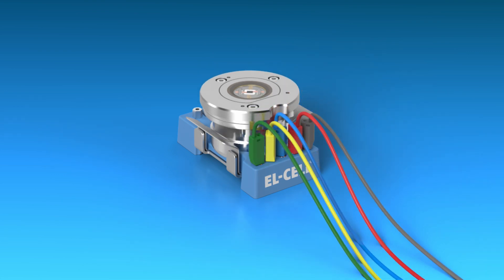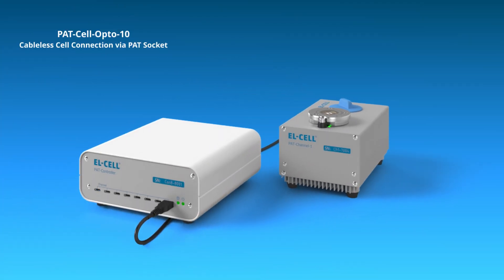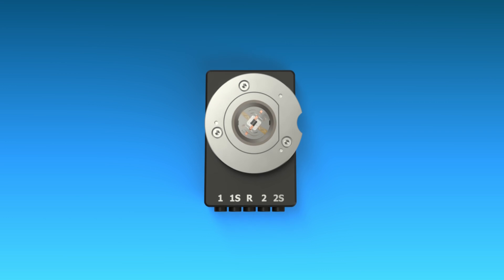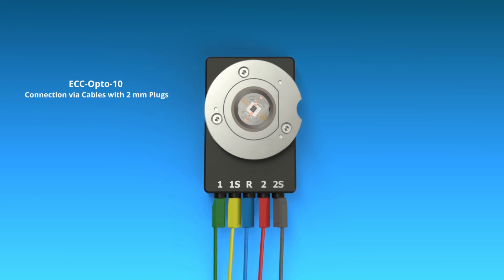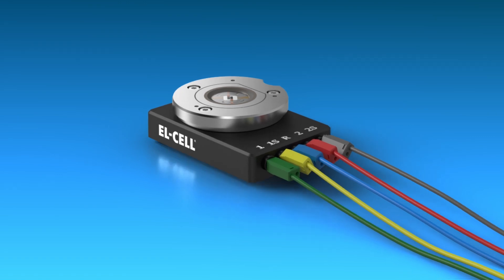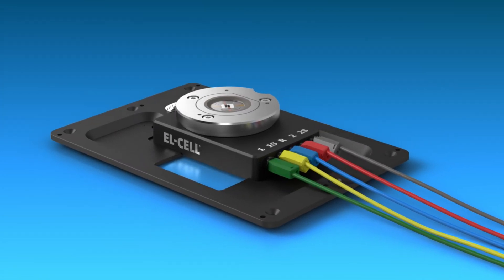To connect the Patzell Opto 10, you can simply plug it into a Pat docking station or Pattester Potentiostat. The ECC Opto 10 is connected via conventional 2 mm banana plug cell cables, and its low profile cell holder fits easily on a standard microscope sample stage.